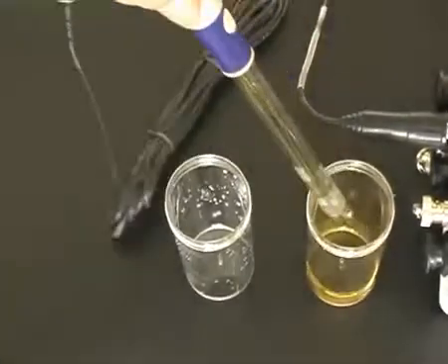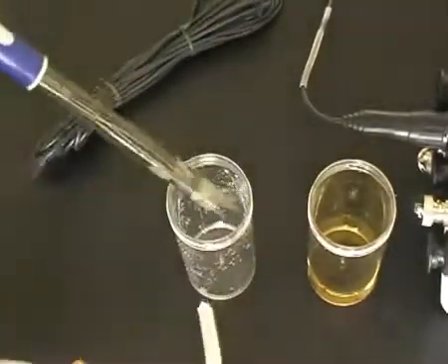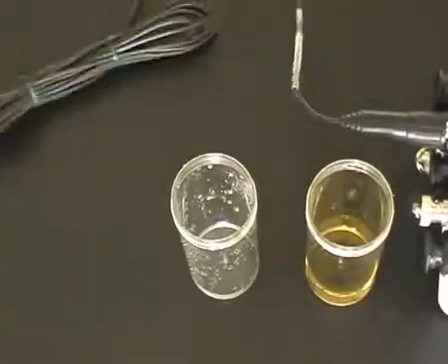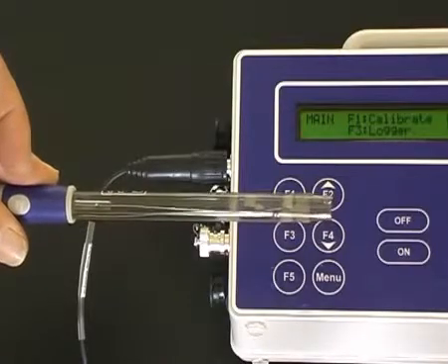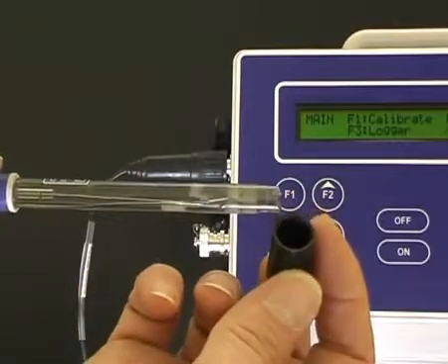Remove the pH sensor from the 6.88 buffer and rinse with deionized water before use. To store the pH sensor, just replace the wetting cap back on the end with a bit of tap water in it.